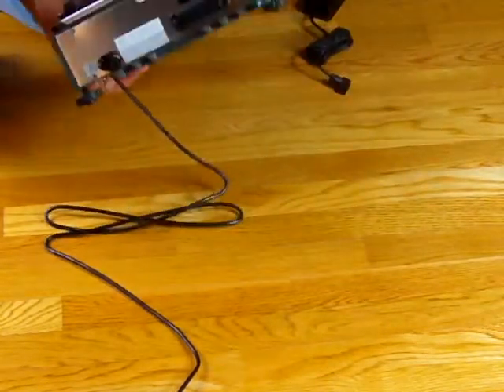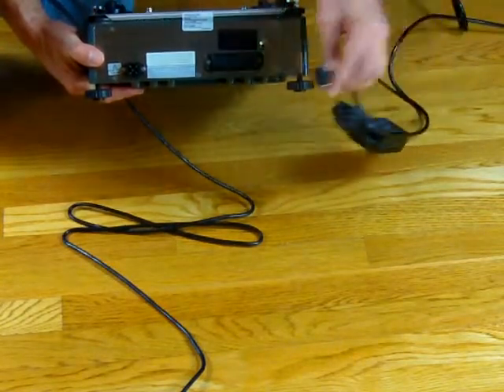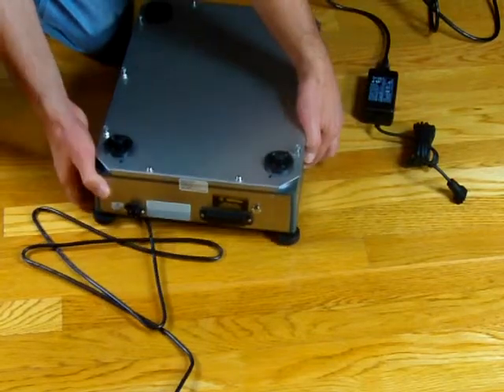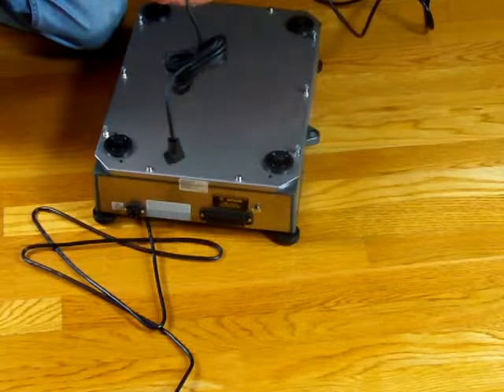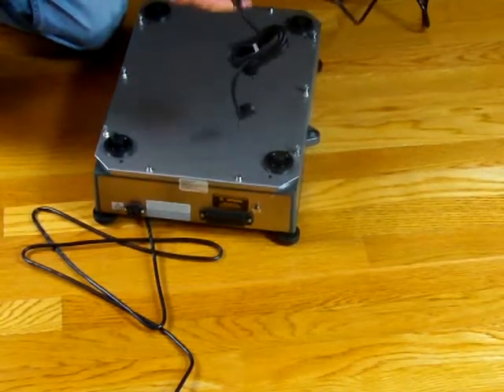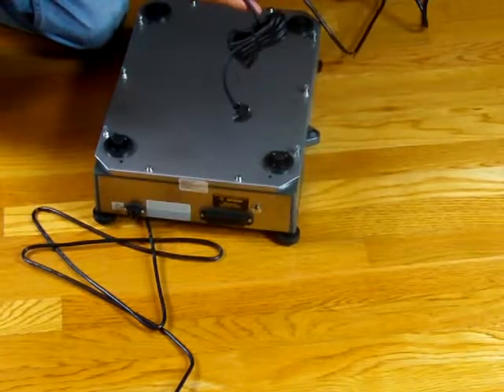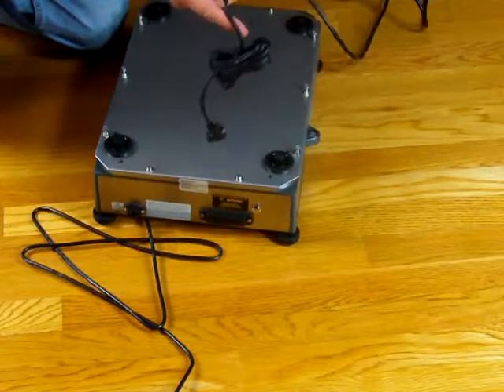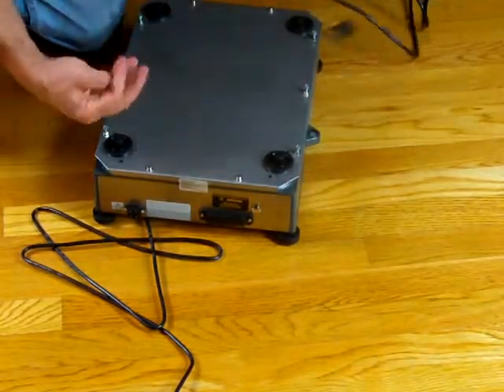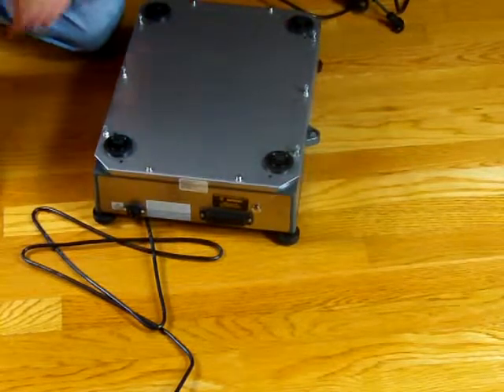On the back we have four adjustable feet, and on the rear of the balance there is an RS232 interface — the AC adapter just plugs in, it's almost a military grade adapter. These balances are now coming with Sartorius' new AC adapter that automatically senses whether you need 110 or 220 voltage. Since we sell in the United States, the adapters all come with a 110 power cord, but if you're ever going overseas all you need is a 220 power cord — this power supply automatically senses the input voltage. It's a really nice heavy duty AC adapter, and this balance is what we would classify as an industrial high capacity precision balance.